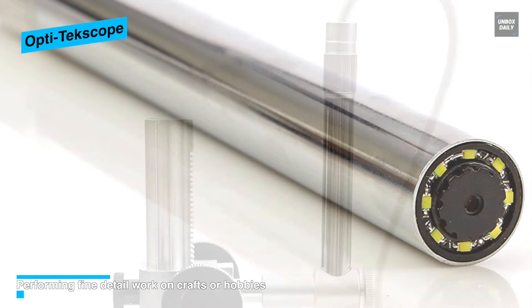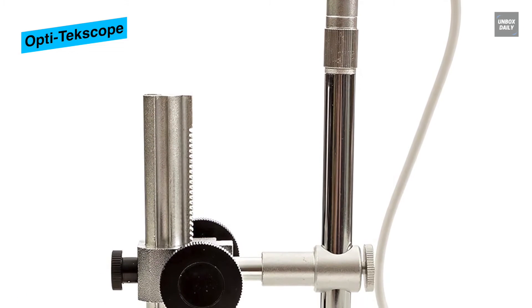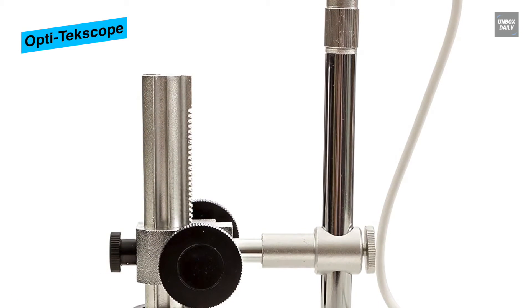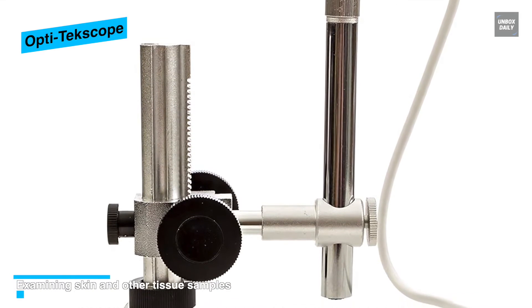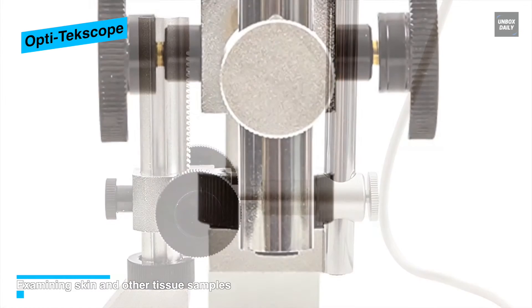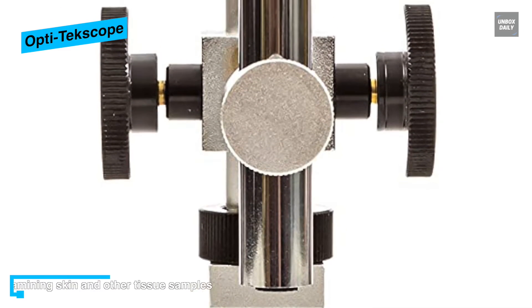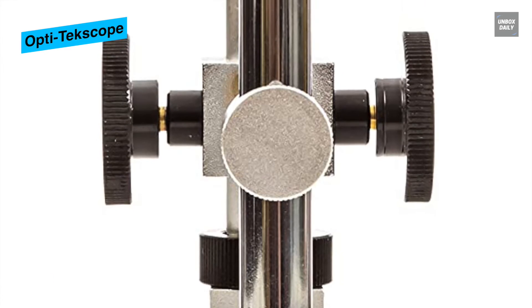Using the focus handle on top, users will find it achieves high accuracy during adjustments. It also comes with various accessories that enhance functionality, allowing it to be used by professionals such as medical service experts and electricians, which sets it apart from other devices on the market.